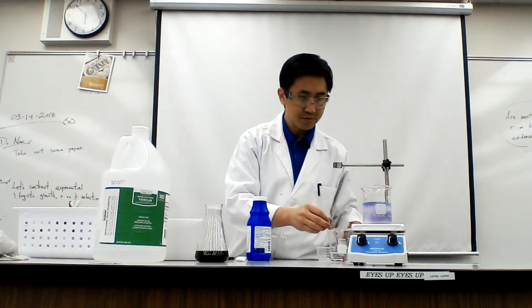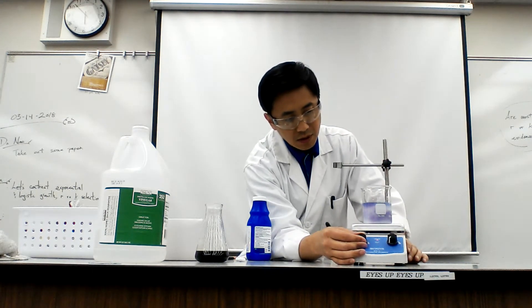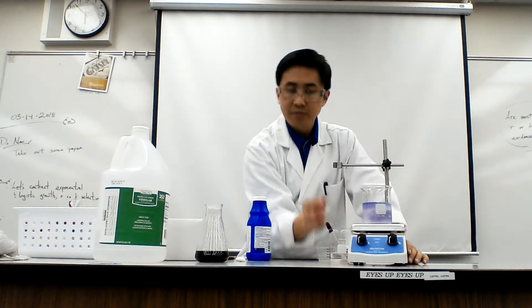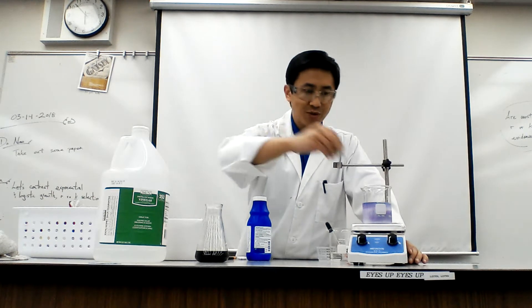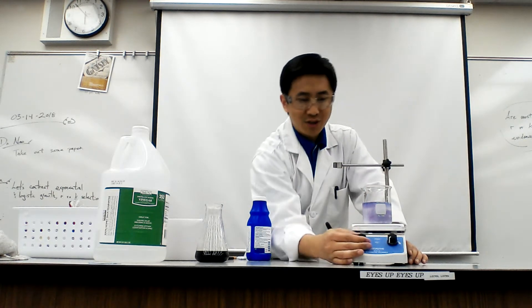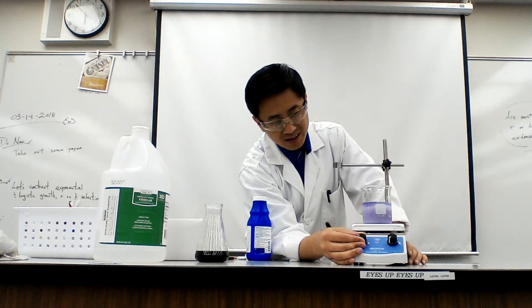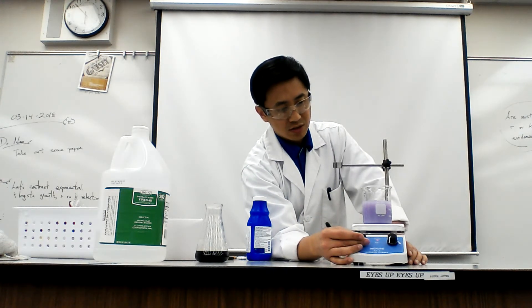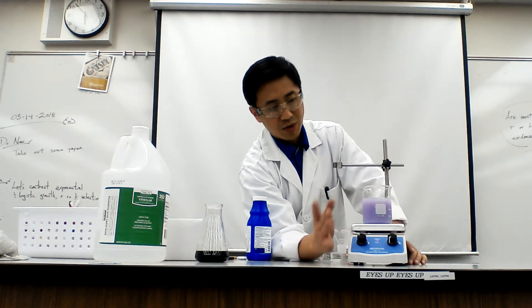Let's give it a stir. I'm going to put it on the plate, put in the stir rod, and then turn it on. Be careful not to stir it too quickly — if you stir it too quickly, then the color change happens too fast and you don't get to see all the neatness that occurs. Notice that that's too much.